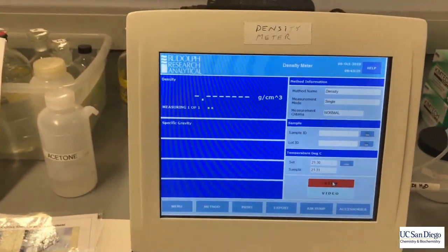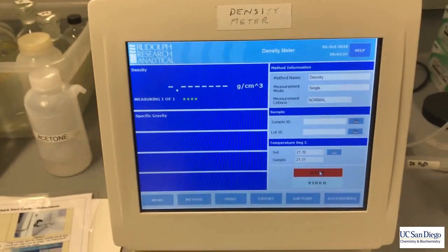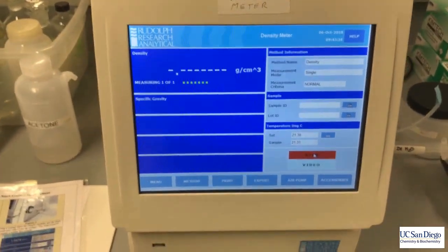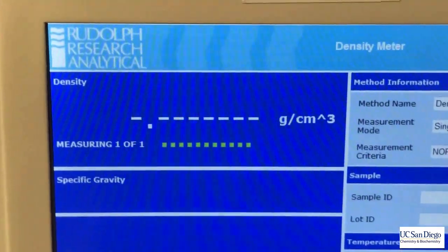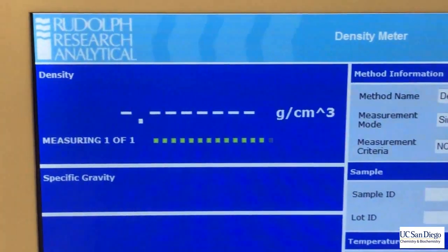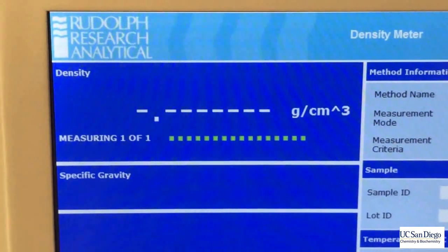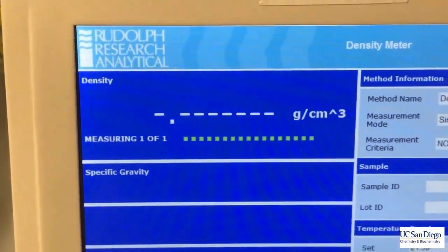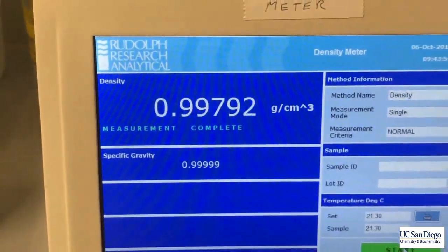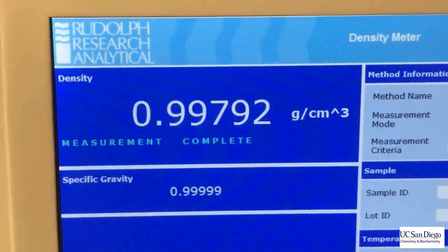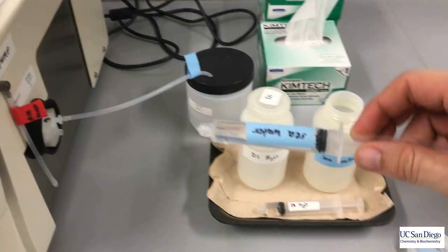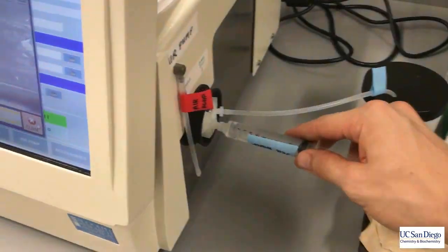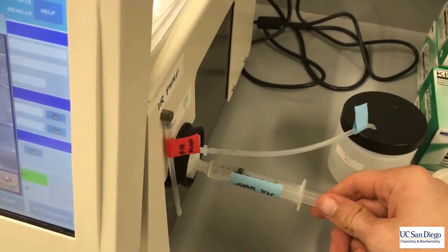Now we can actually start the measurement. At this point you just sit back and wait. It will be good to check the reading against the CRC handbook — and in this case it happened to be right on the money.